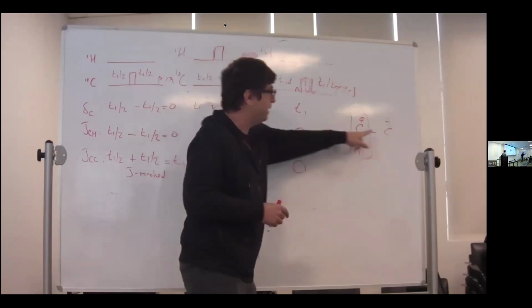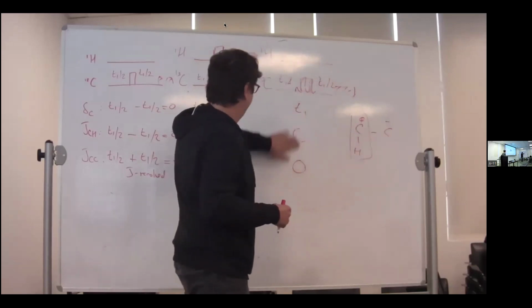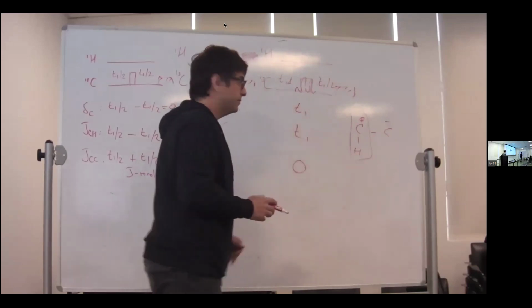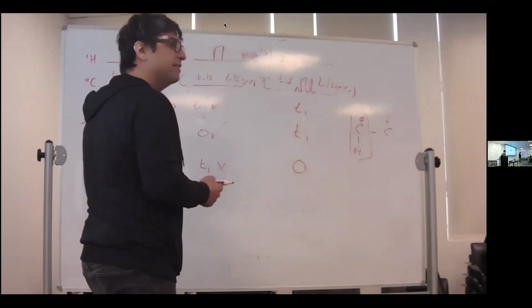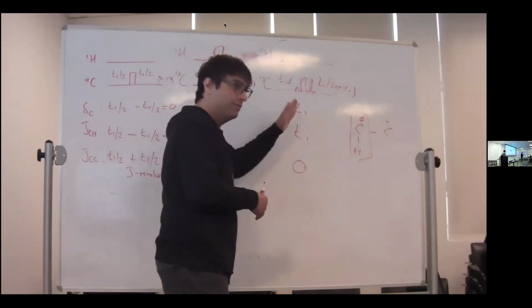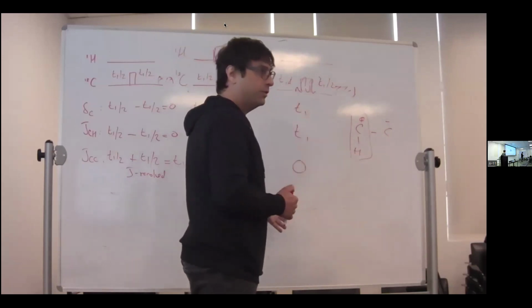Now you're hitting the passive carbon with the 180, getting rid of carbon-carbon coupling, but you do not affect the CH. So it's the same as the first one, except you're on the other carbon? Yes, exactly. So this would absolutely work in a real experiment. This is what you would achieve.